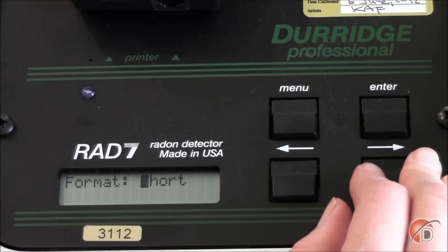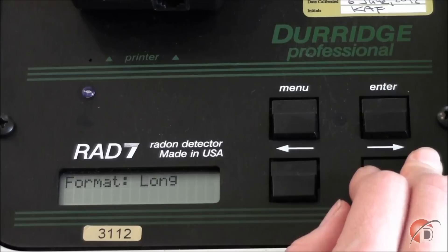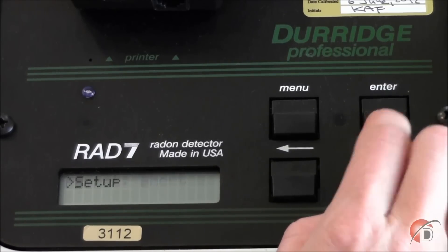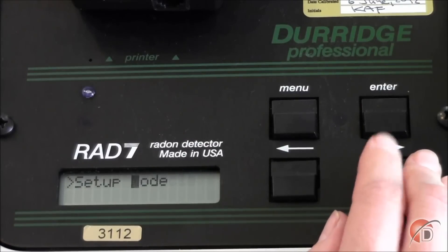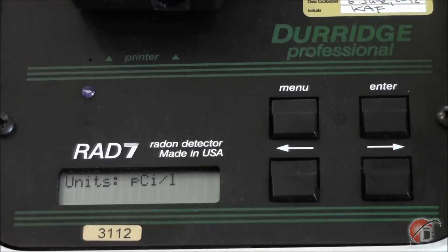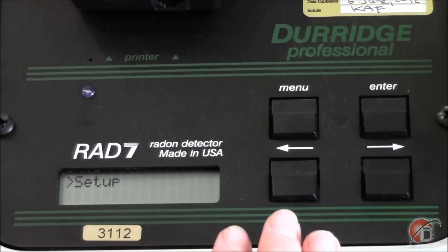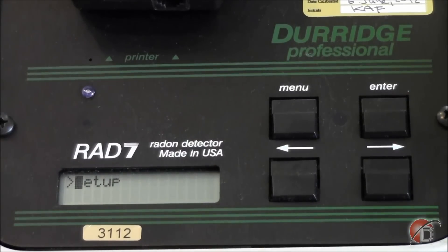The Format option allows you to choose how much information is printed by the infrared printer every hour. I will set this to Short. Our data is recorded in units of picocuries per liter of air and degrees Celsius for temperature. No matter the length of printed record or what units you choose, all data will be stored in the RAD7 memory, and I will show you how to download this information in a subsequent video.